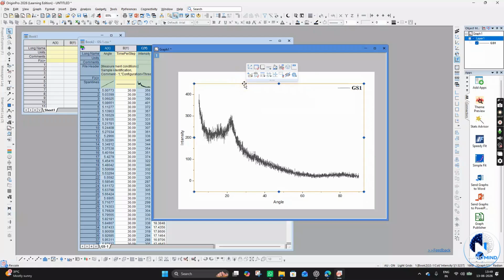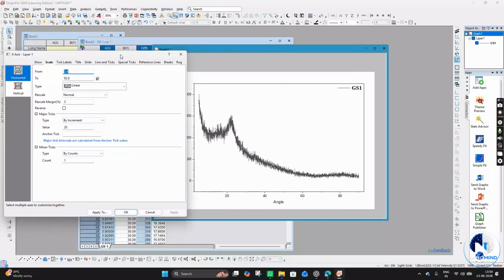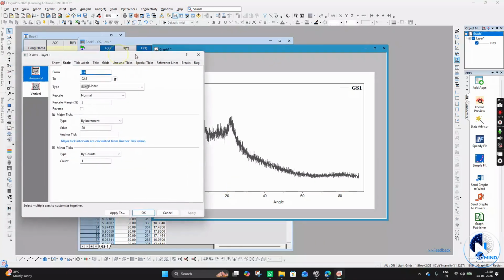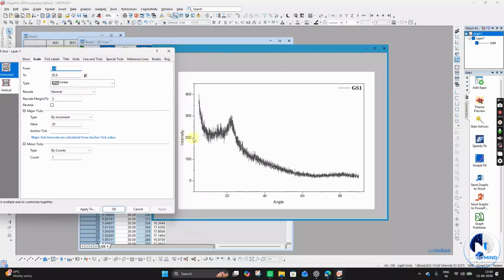If you select this box, double click on that line. Here you have to identify the label lines, the XY values. You can edit just the line width, and that's enough; automatically these line widths will be updated. If you have lines with some values attached like this, that particular line you need to edit. Here I will show you.